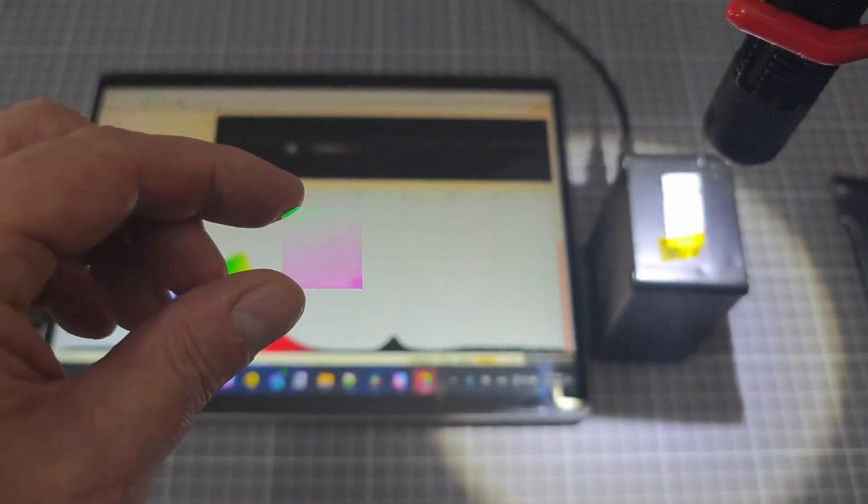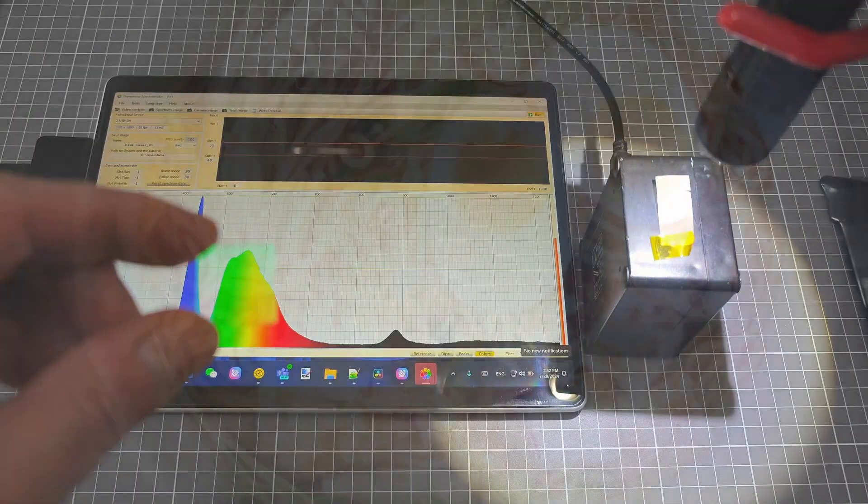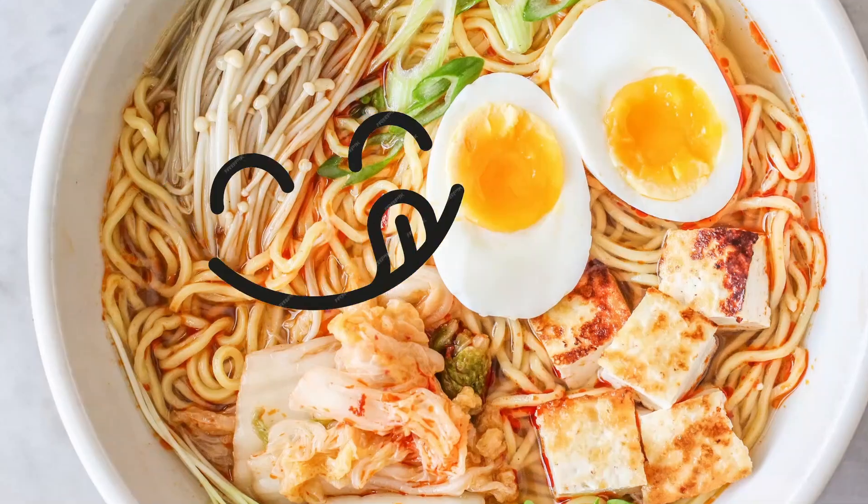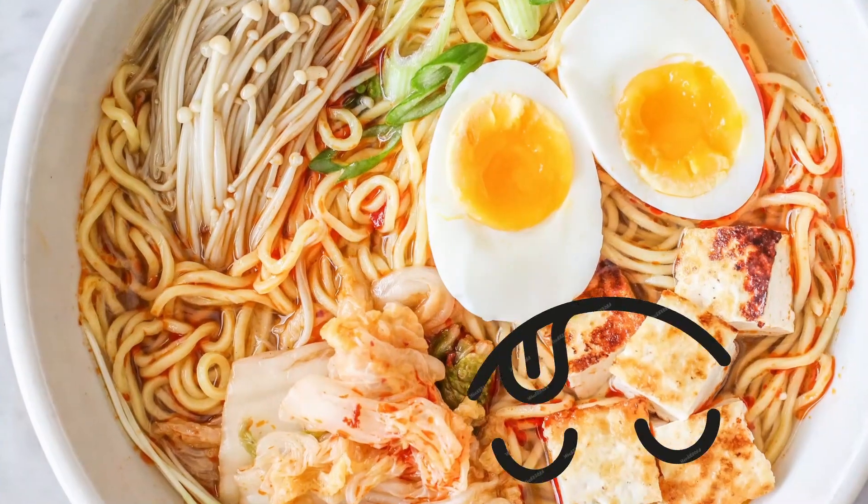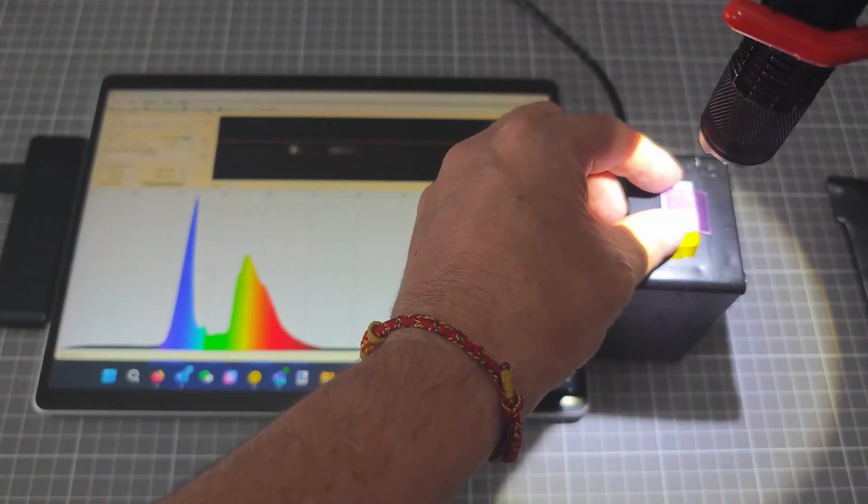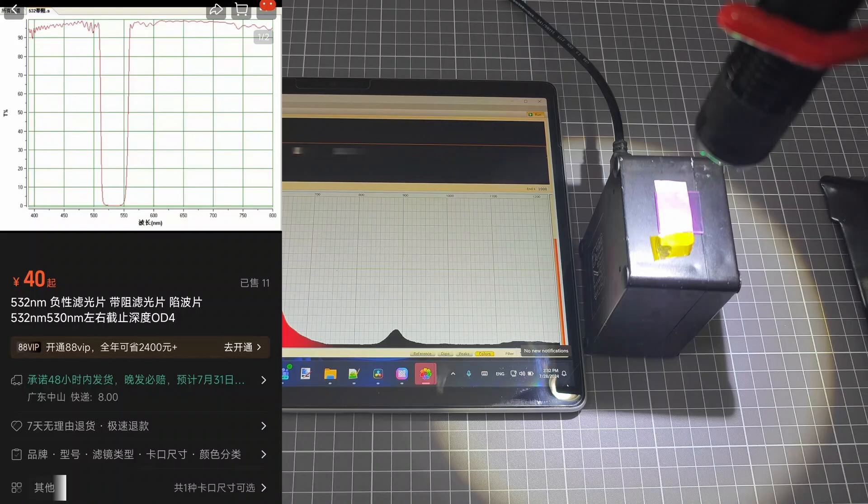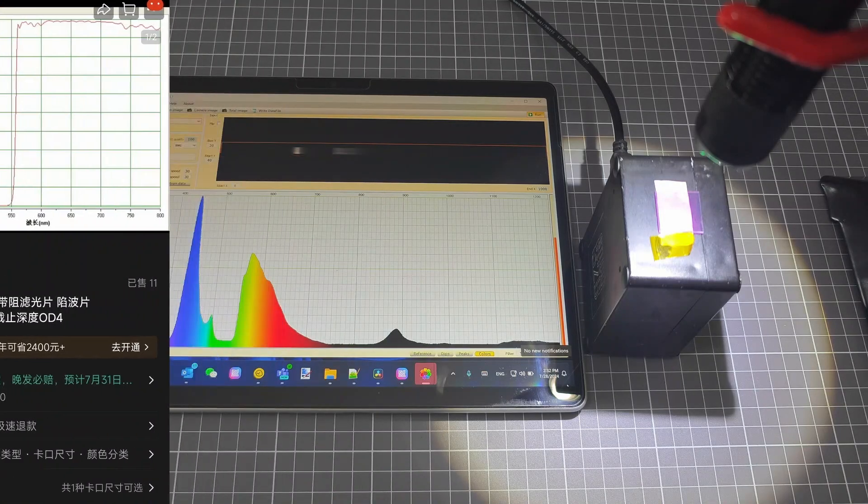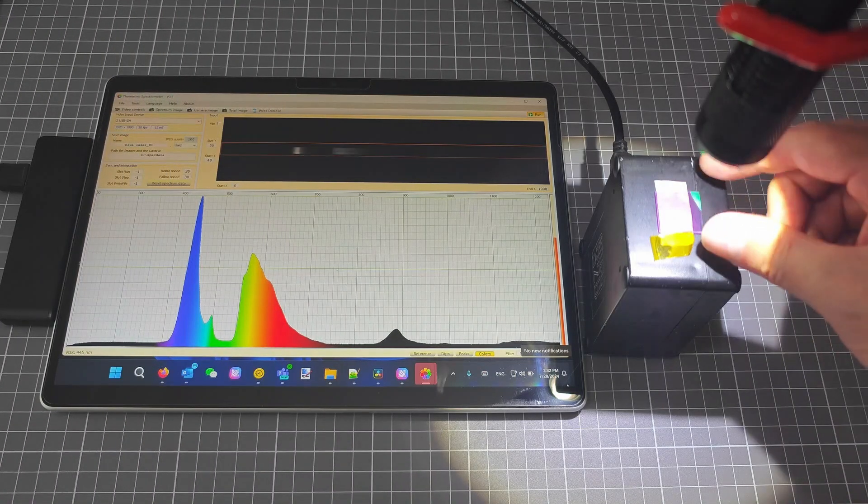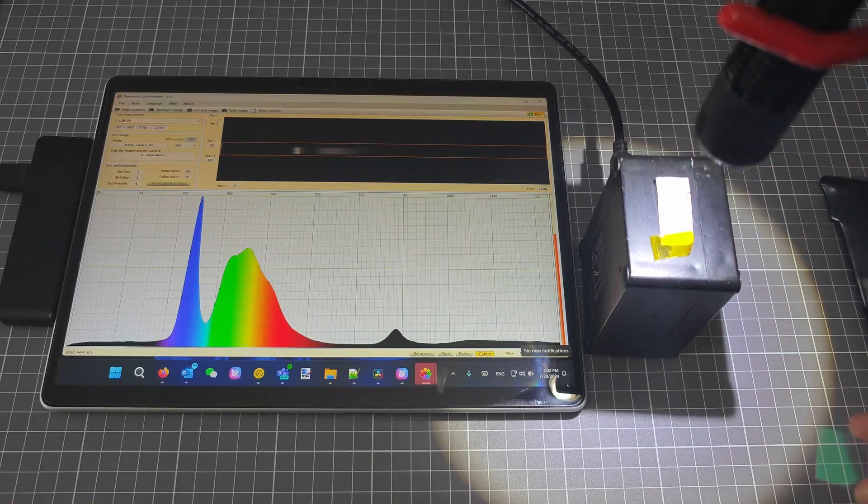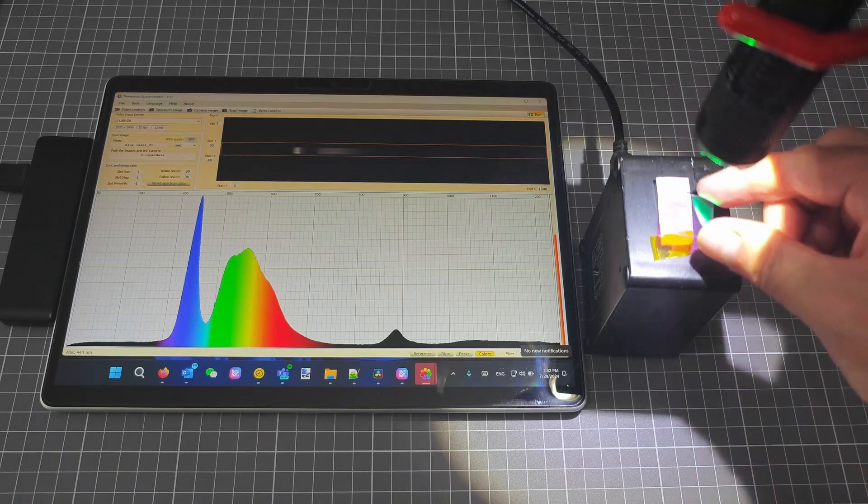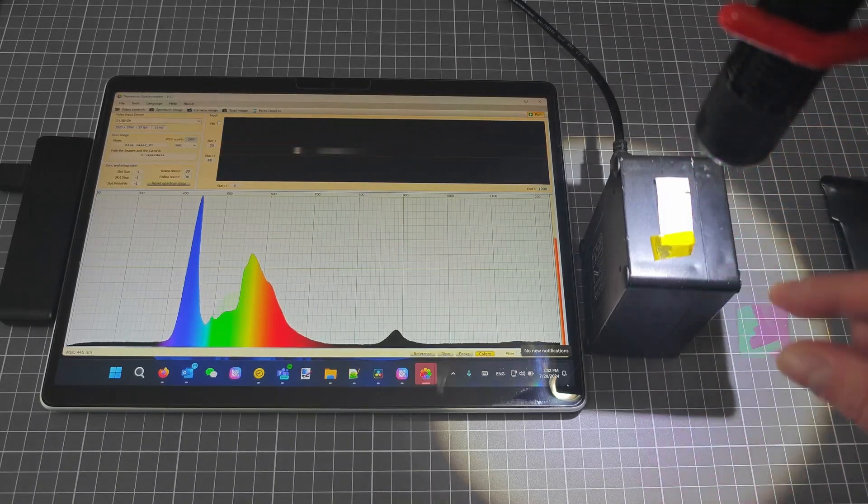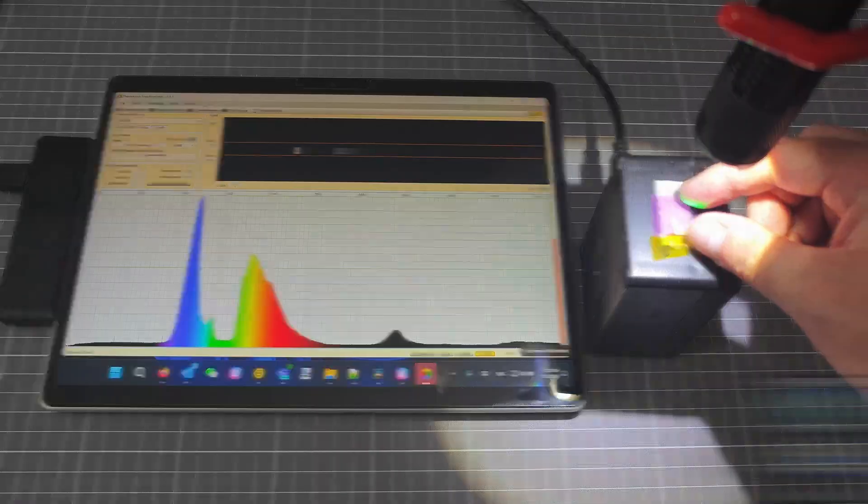So we were considering making a Raman spectrometer, so we bought a band cut filter. No, not that kind of Raman. The filter we got claimed to have a discrimination level of OD4, or 10,000 to 1. But after testing with this device, it was clear that it didn't even meet OD1.5. We returned the filter and got another one.